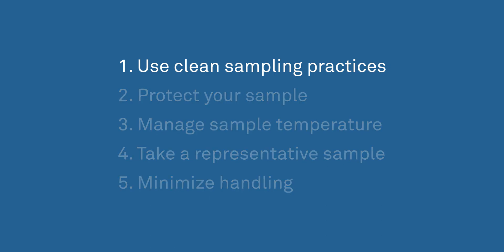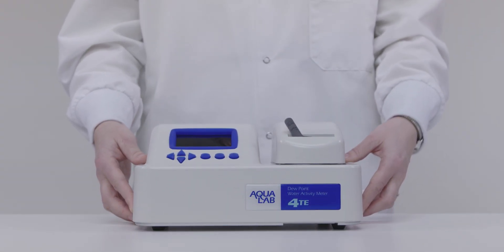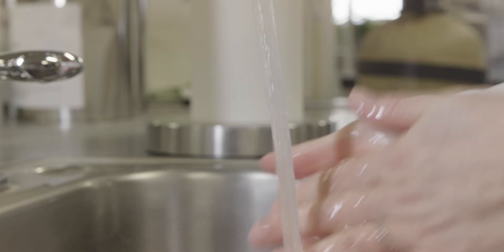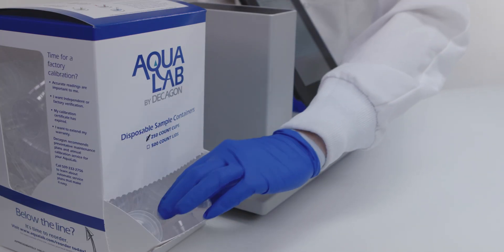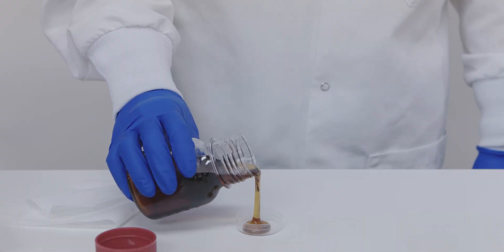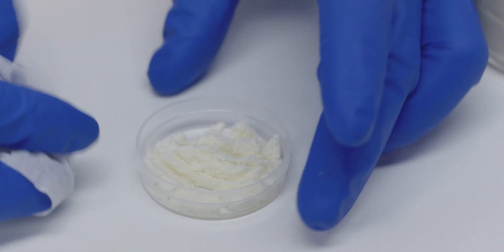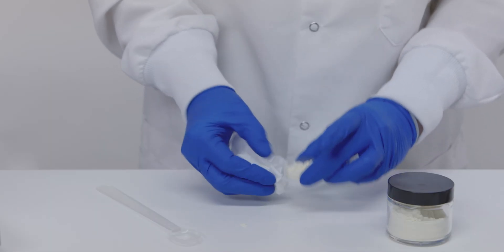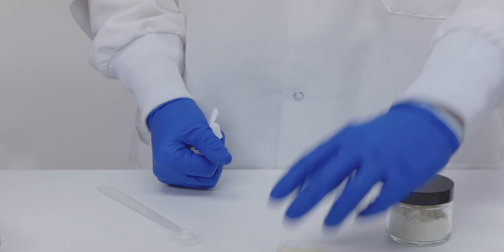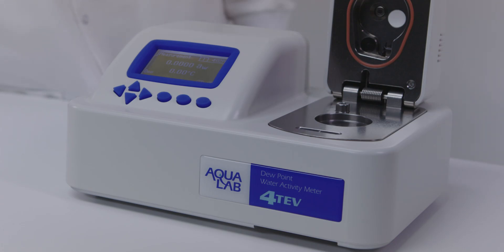One: use clean sampling practices. Place your instrument in a clean location. Make sure you have clean hands or wear lab gloves. Use a clean sample cup for each reading. Fill your sample cup no more than half full. Wipe the bottom, edges, and rim of your sample cup with a Kimwipe before putting it in the instrument, so you don't contaminate the sample chamber. Even small amounts of water or contamination can significantly affect the reading.